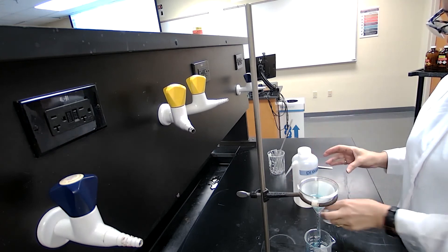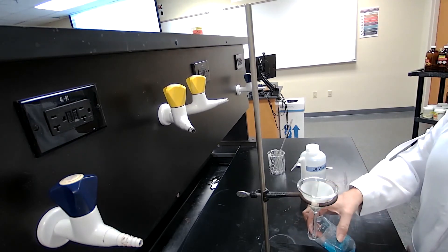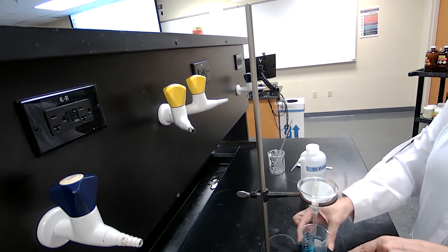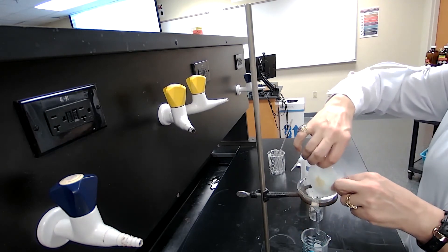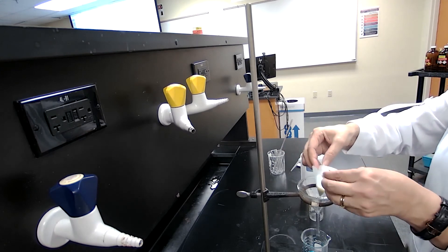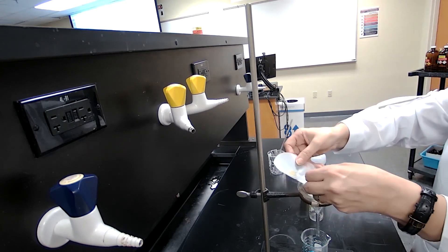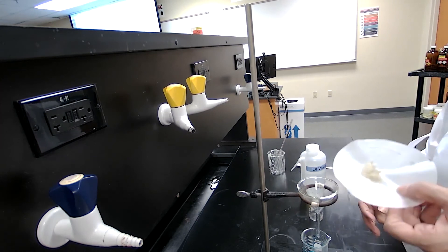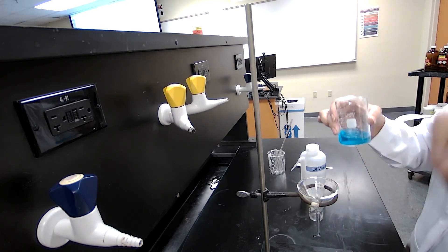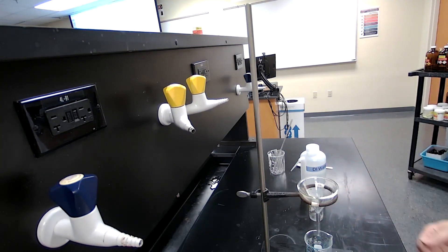Now we have separated the solid from the liquid. The liquid portion — the blue copper sulfate solution — is in the beaker, and the sand is on the filter paper. If you need to recover the materials: take the filter paper out of the funnel, place it on a watch glass, and let it air dry — then you have dry sand. The liquid can be evaporated and you end up with copper sulfate. That is the separation technique using physical means.